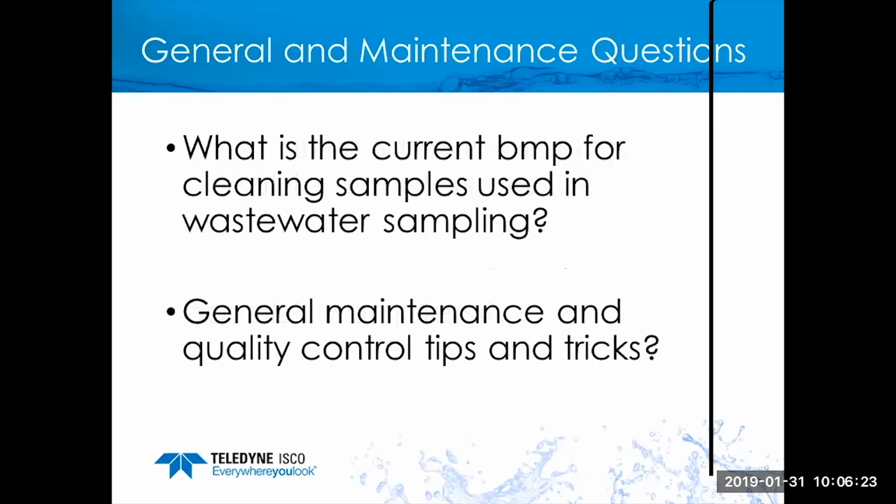The next question comes, what is the current best management practices for cleaning used and wastewater samplers? First of all, I will always defer to the lab and whatever protocols that they're suggesting be utilized. They're the experts. They have the guidelines for specific cleaning methods. And predominantly, they understand what substances can be used and what substances may interfere with the analysis procedures. Secondarily, much of this depends upon what we are sampling for.